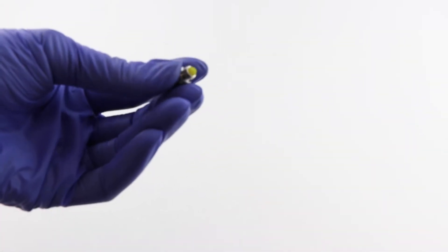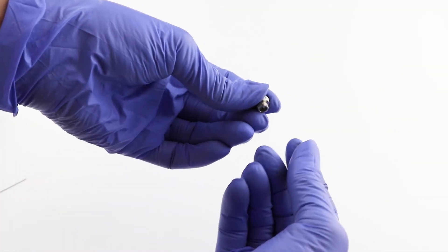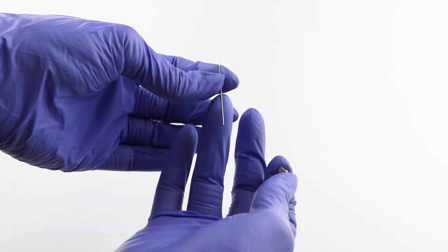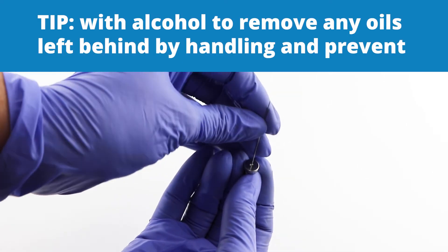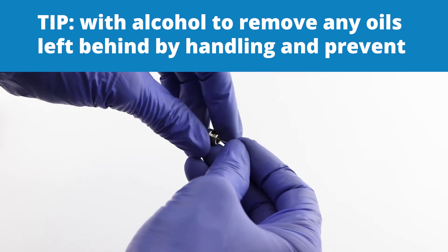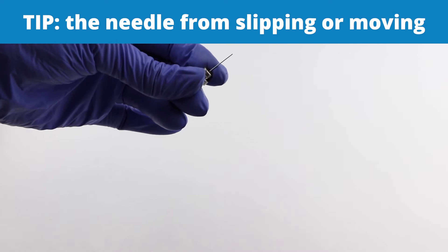You can see the gasket in there. Push the blunt end of the needle through the screw cap, like this. You can clean the thick part of the needle — the shank that goes into the gasket — with alcohol to remove any oils left behind by handling, to prevent the needle from slipping and moving.